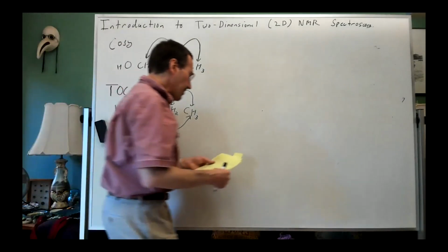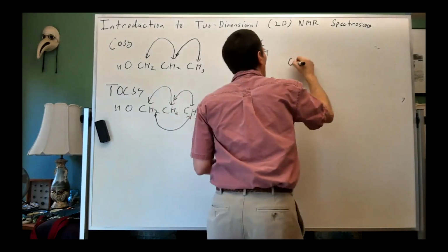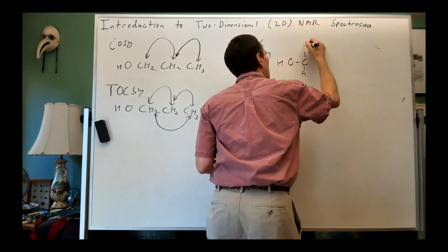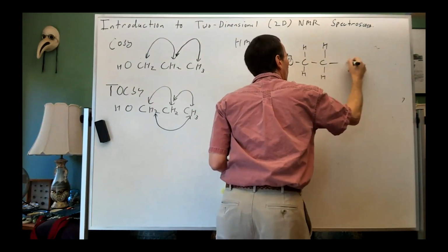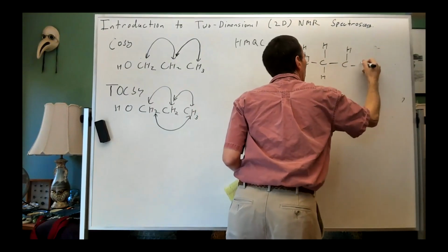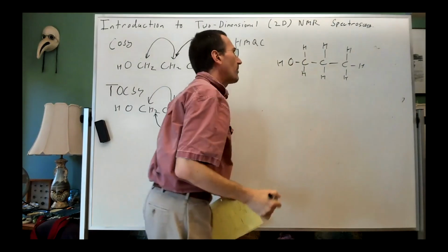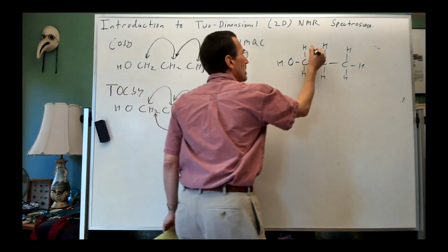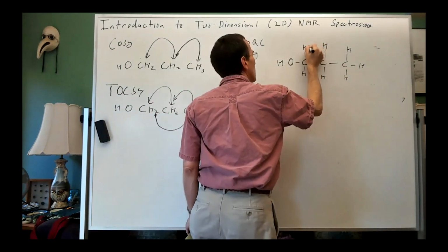For HMQC, I'm going to diagram this out as follows. And say for HMQC, what we're going to see is how the hydrogens correlate with the attached carbons.